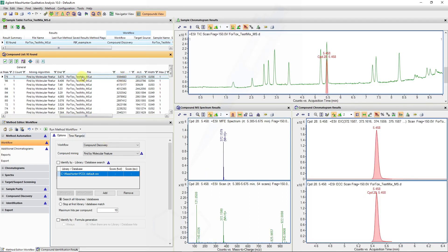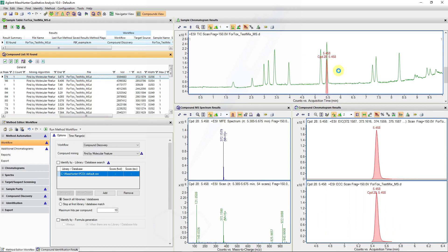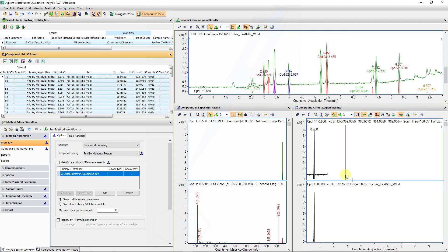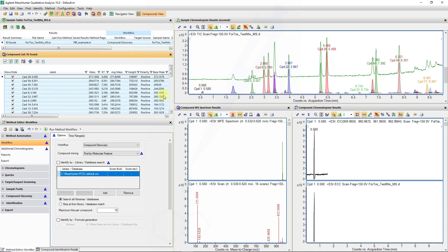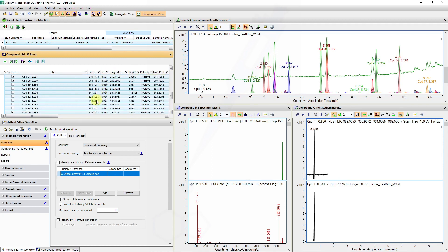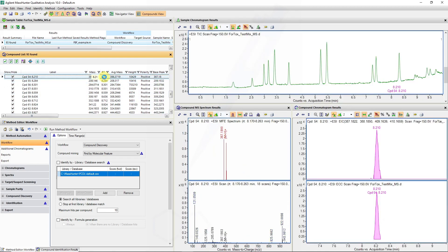We can right-click and say select all, which will give us an idea how the extracted compound chromatograms overlay with the TIC. You can see most of our features in the TIC have been found. This is a set of standards we've injected, and I know my diazepam compound elutes at 8.3 minutes, so I will evaluate the quality of the extracted spectra with this.